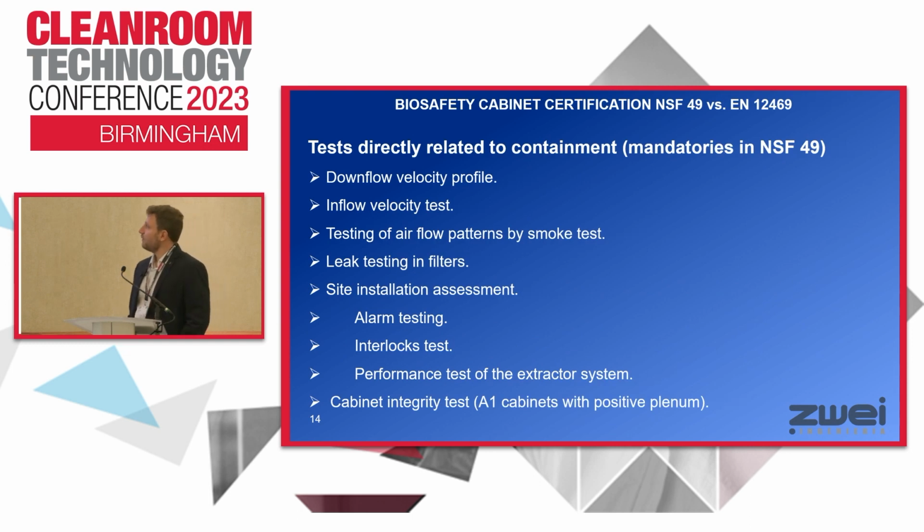There are tests that are mandatory in NSF 49. The downflow velocity profile is very specific. It's an instruction on how to calculate the distance between points and the height of the anemometer sensor, and there are so many things to keep in mind when we perform this test.